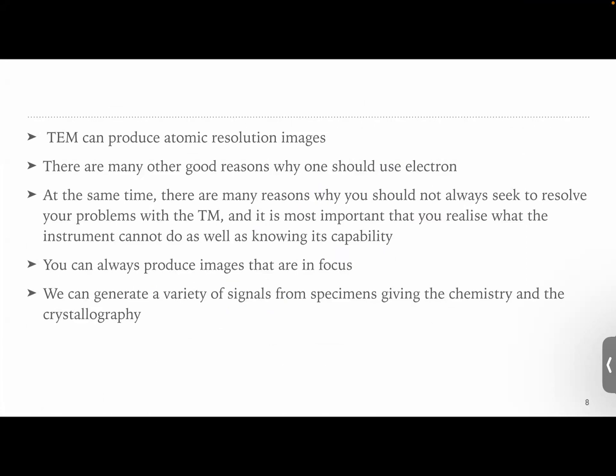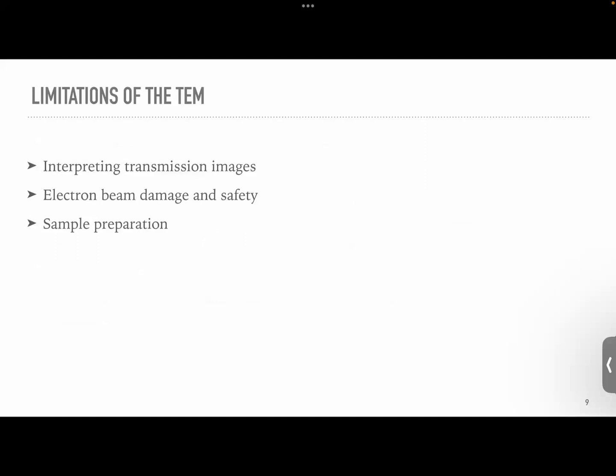And when we are talking about transmission electron microscopy, we can check which elements are there, and what is their proportion, because as their atomic number increases, the deflection of the beam increases. So according to the deflection, the sharpness of the image, or we say the contrast, will change. According to the contrast, we will get to know which atomic number atom is present where. Okay. Yes. So these limitations I already talked about.